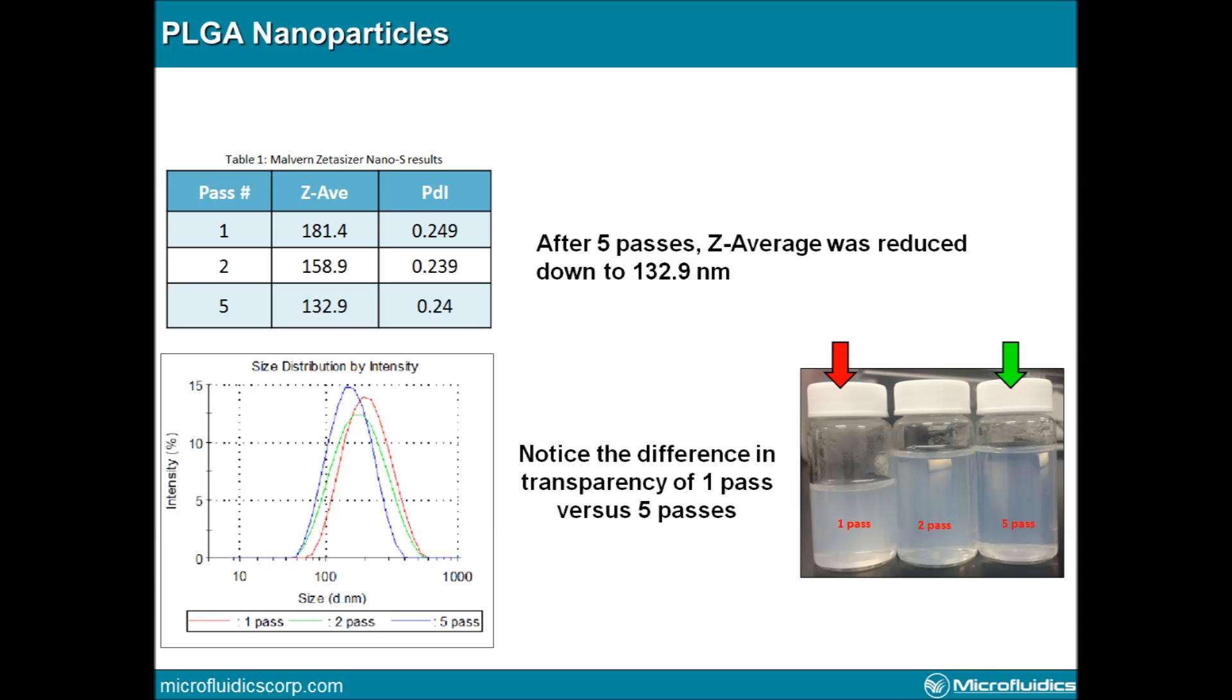Here, both the particle size analysis data as well as the distributions can be seen for all three passes. It is also interesting to note the transparency difference between the sample collected after one pass and the sample collected after five passes.